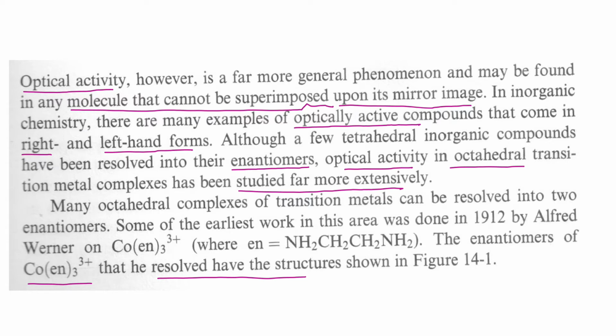The compound we are going to prepare is tris(ethylenediamine)cobalt(3+). As you know, we always start with cobalt 2+, because cobalt 2+ is labile and cobalt 3+ is inert.